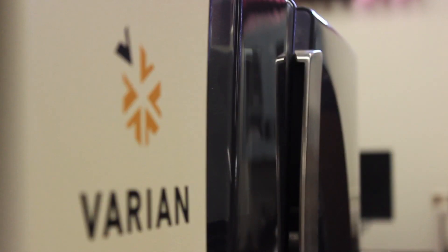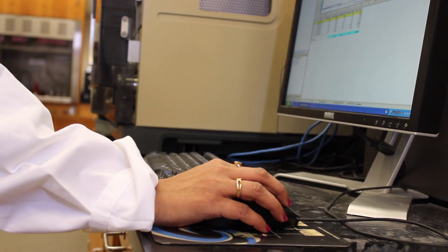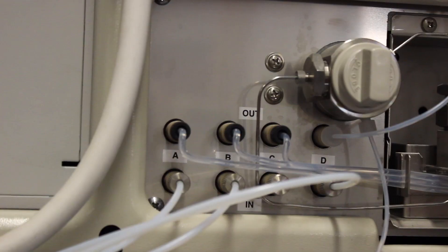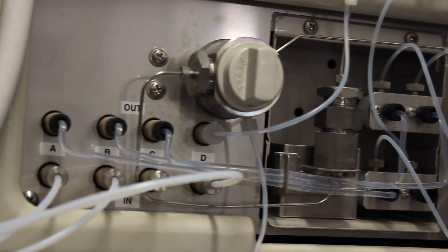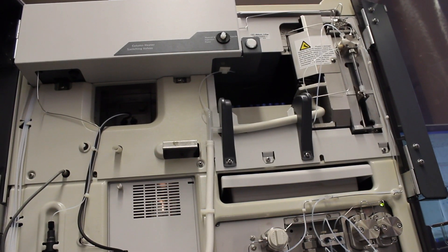This is HPLC, which is high-performance liquid chromatography. This machine is used to separate organic compounds from a liquid mixture. In order to find it, we need to identify the compound based on the retention time. There are so many different applications for this instrument, such as chemical, environmental, bioscience, pharmaceutical, and consumer product applications.